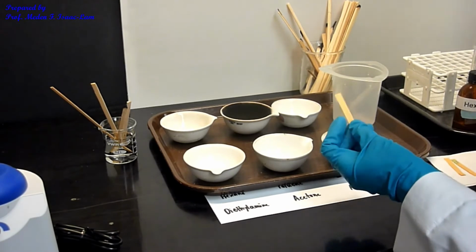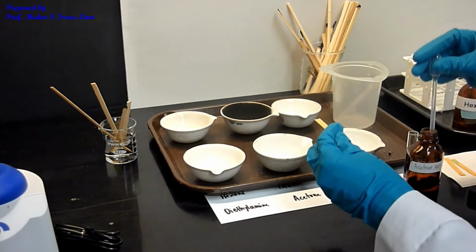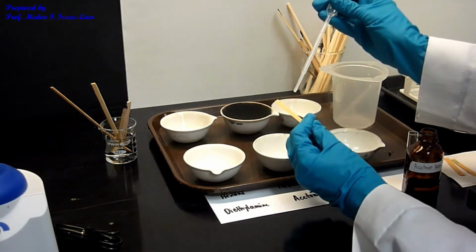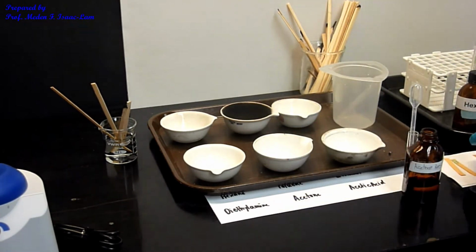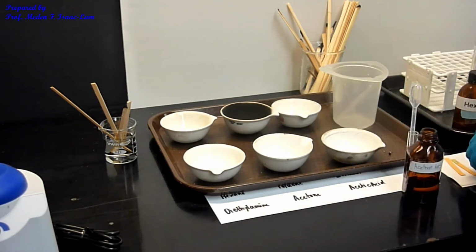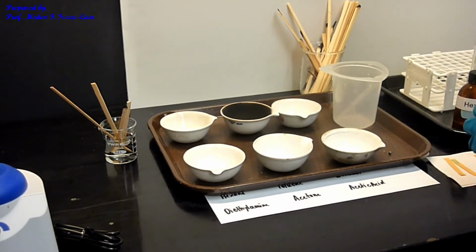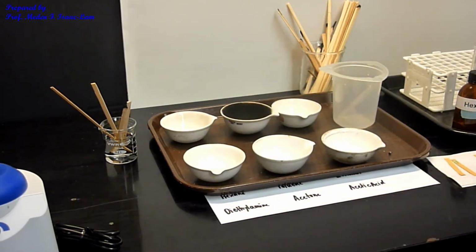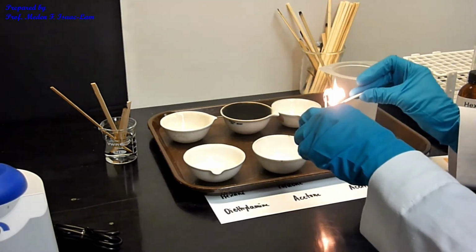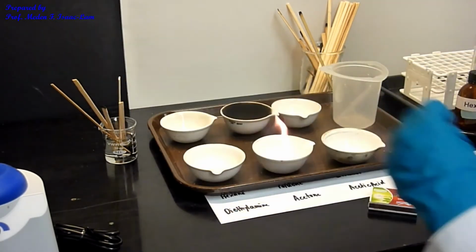I can also put a drop, because this is volatile, so I'm going to also do a drop. Okay, so the same color, nothing. So that was again the same color, 6. Okay. And I have still acetone in here, so I'm going to do the same idea. So that is combustible. Okay.